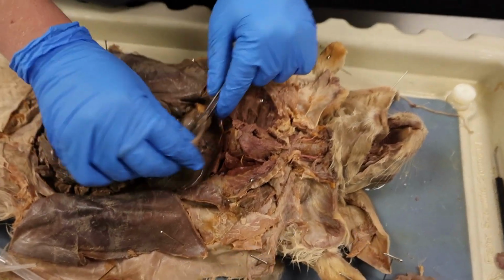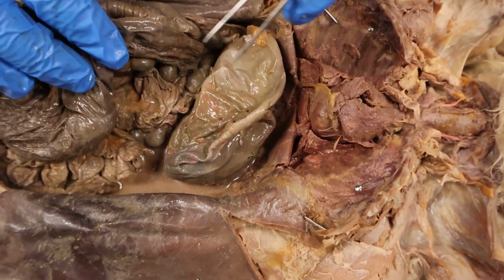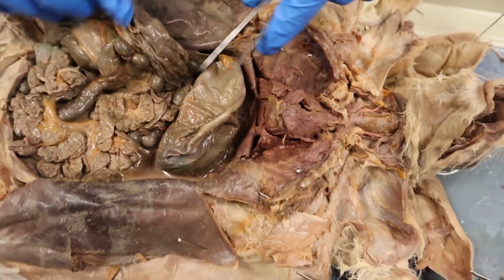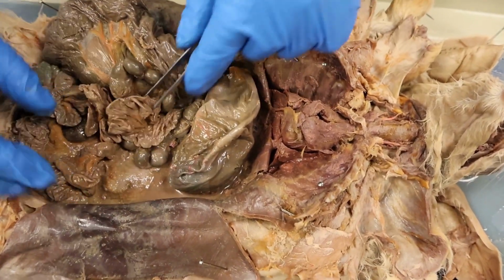Alrighty, so this is going to be our stomach. Basically just a bag of acid. It's going to churn up and break down food, make it into a usable product.